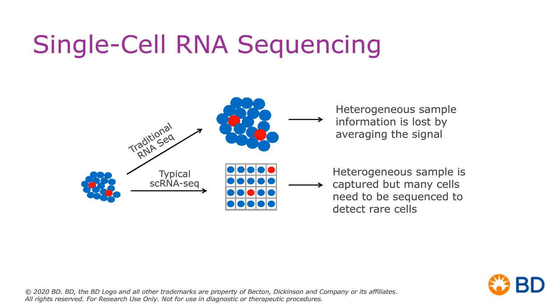Well, sure, I could sort out the natural killer T cells, but in this initial approach, I would still have very much a bulk population, and there's a lot of heterogeneity within there. And even if I'm doing some pre-enrichment, the nuggets of gold, basically, these red cells, are probably the ones that I'm most interested in. But when I did this bulk RNA sequencing, essentially anything that was unique about these two red cells would just be lost by averaging of the signals.